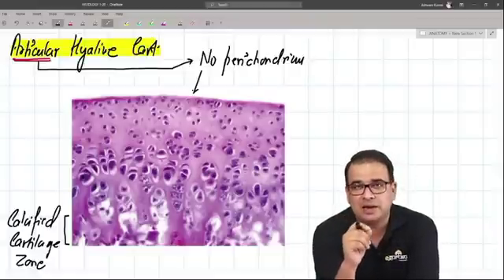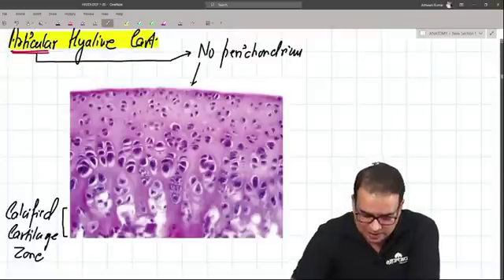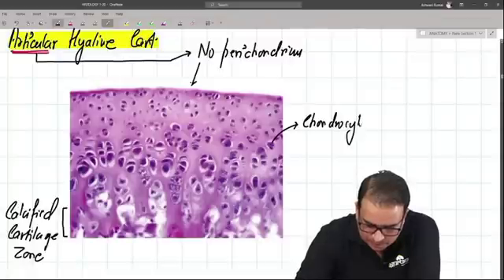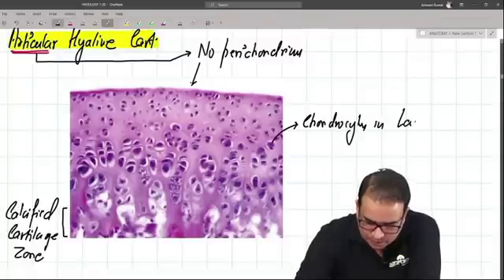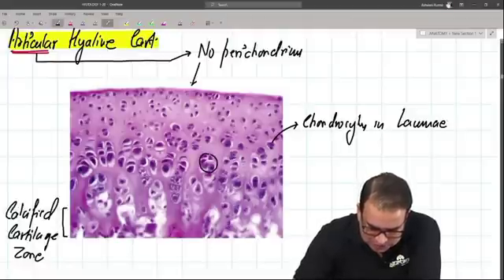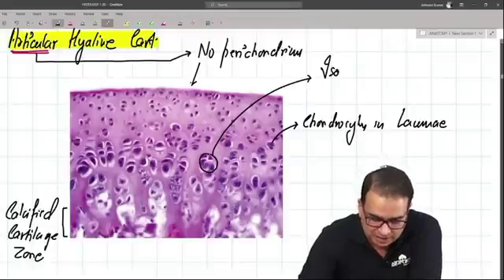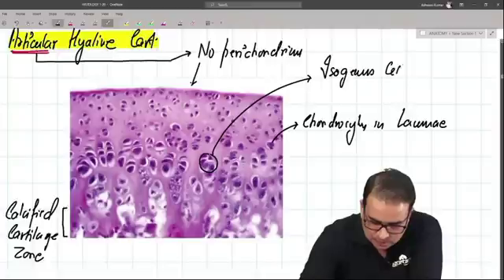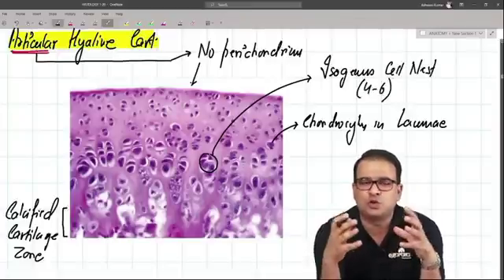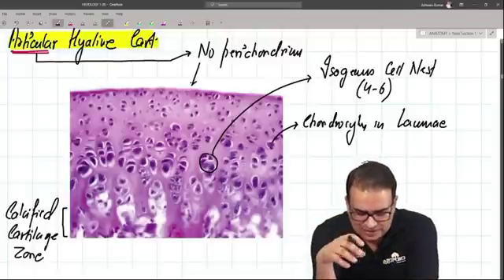It's an articular hyaline cartilage which does not have a perichondrium. The rest of the features are the same as a typical hyaline cartilage. We have chondrocytes present in lacunae, and you can see these are the isogenous cell nests — another unique feature of the hyaline cartilage. They usually consist of four to six chondrocytes clubbed together.